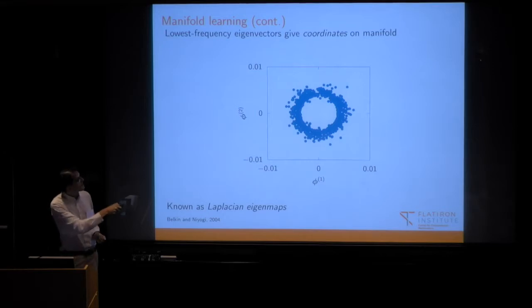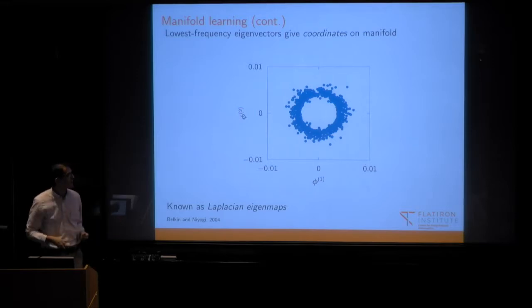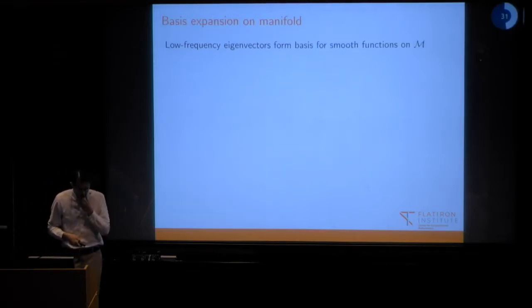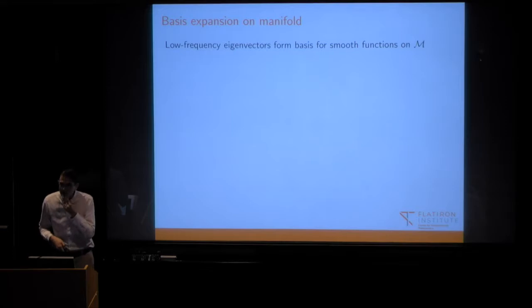So this is going to be very expensive, right? For each one of these points, or for some set of points, you're going to have to do a reconstruction, and you have to choose the size and so on. So this can be a bit difficult. And we're going to take a slightly different approach. We're going to go back to the eigenvectors of the graph Laplacian.